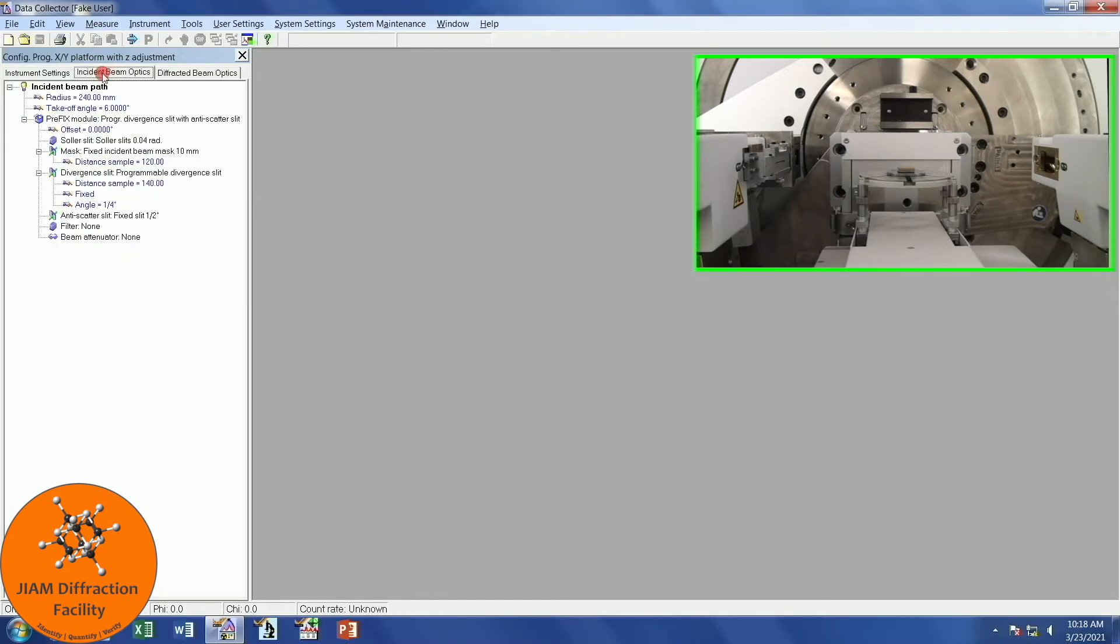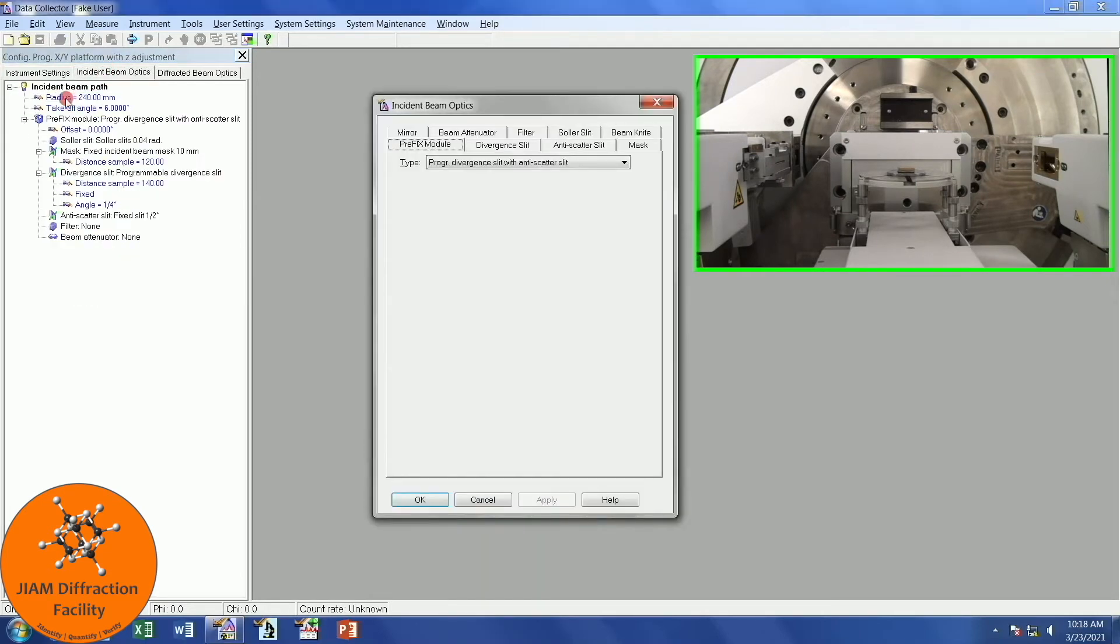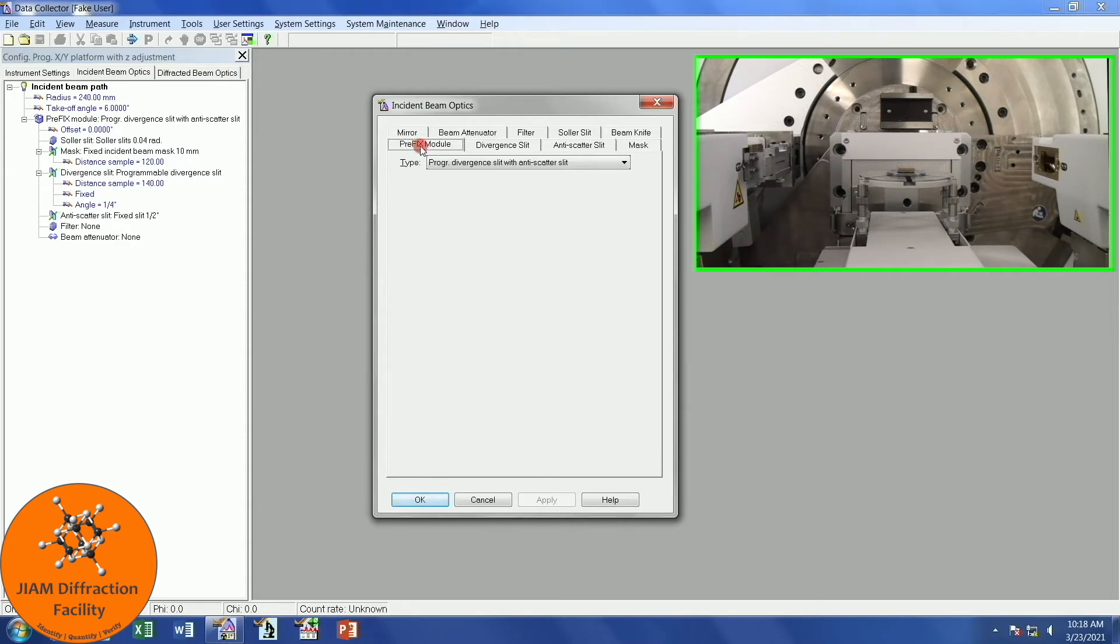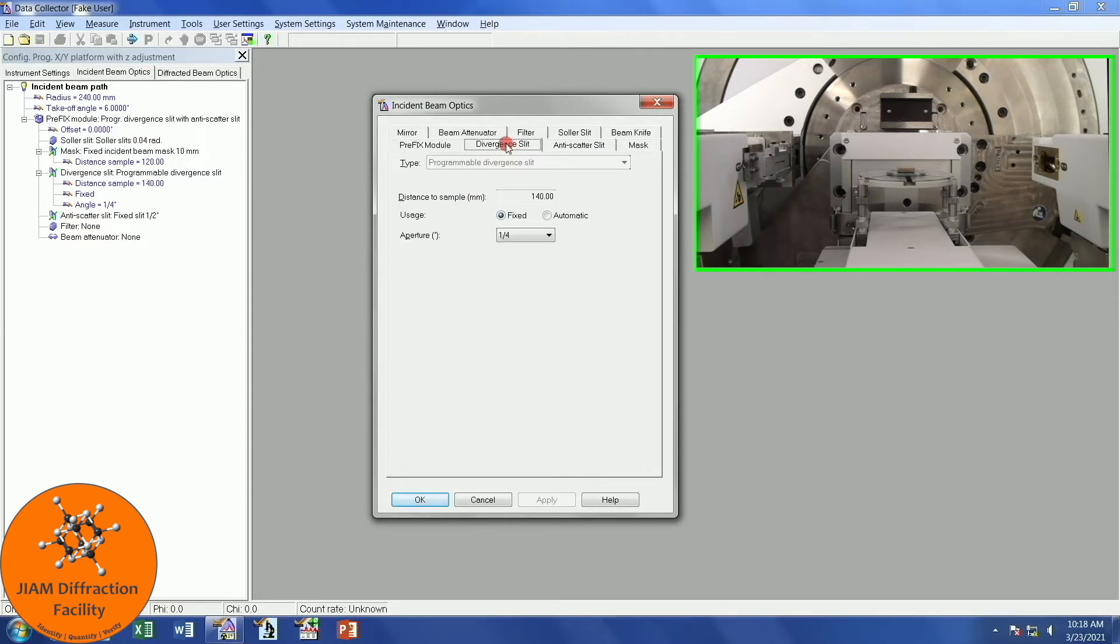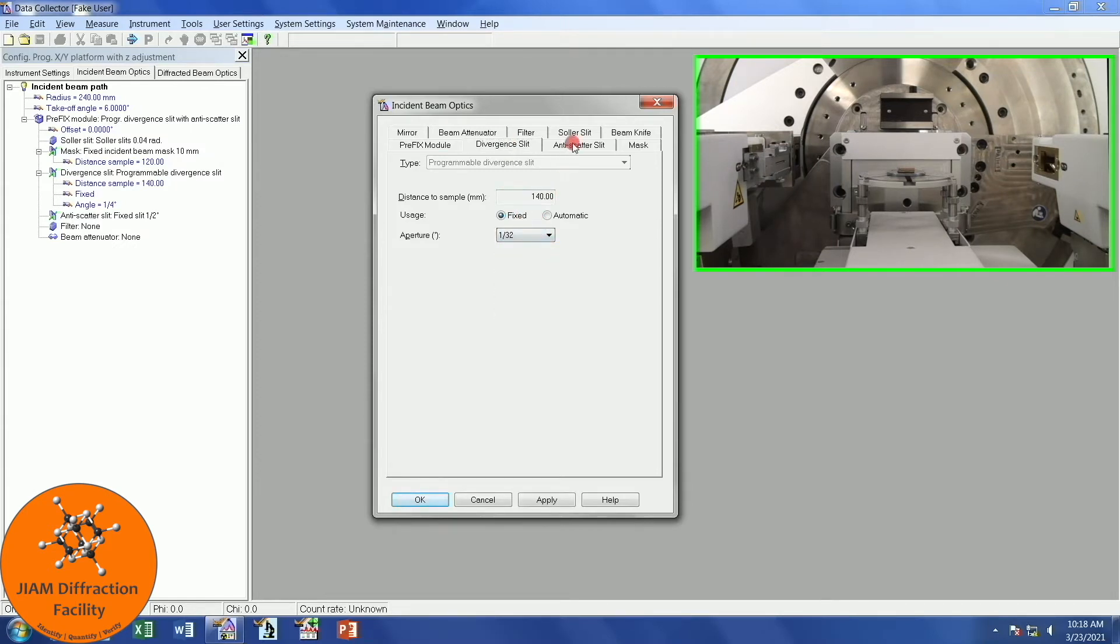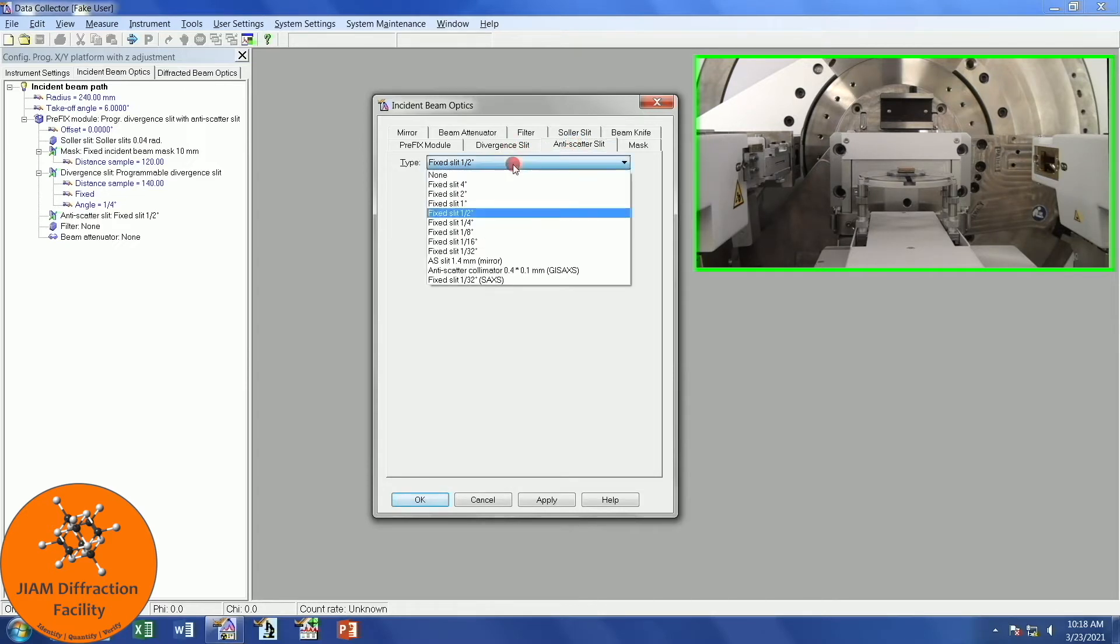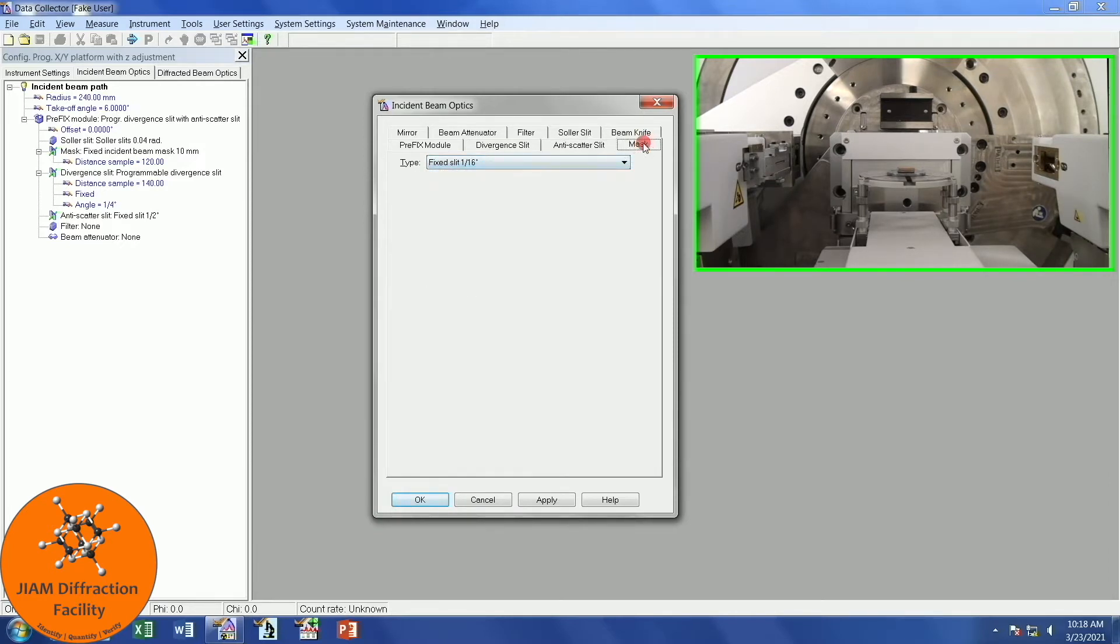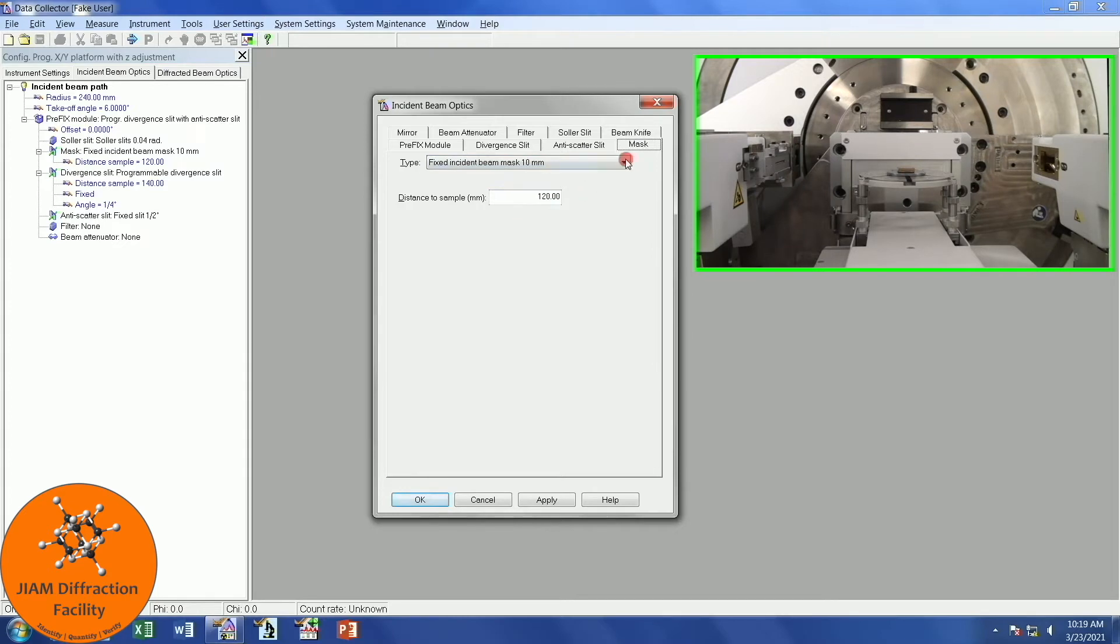Now let's come over here to Incident Beam Optics. I will double-click. I get this window. In here, we can tell the computer what hardware we have installed for the Incident Beam Optics. I will go through each of these tabs one by one. The prefix module is the Programmable Divergent Slit. That's good. For alignment, the Divergent Slit should be 1/32nd. The Anti-Scatter Slit should be 2x what the Divergent Slit is, and if you recall from earlier in this video, we changed it to be 1/16th. I have a 10mm mask installed, so that's fine. You don't need to change the distance to sample.